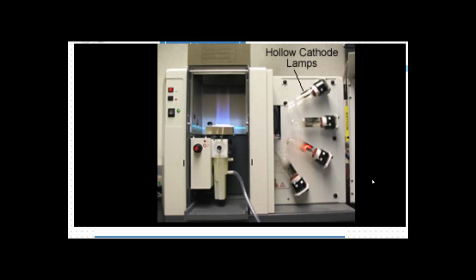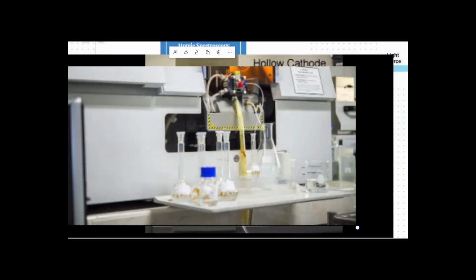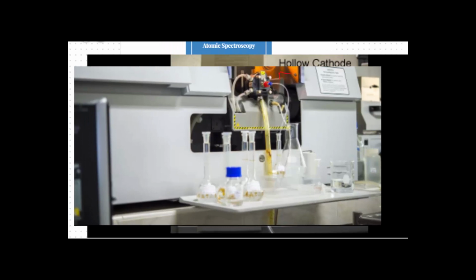A couple of things I want to point out with this particular machine: I want to show you this flame. See this flame right here? That's a really nice flame. It may be tweaked for picture purposes, but when you're working with one of these, you really want to see that blue flame. What you don't want to see is something like, well, the flame is cut off here, but you see how it's kind of glowing orange up here? That shows you that the flame might need tweaking.